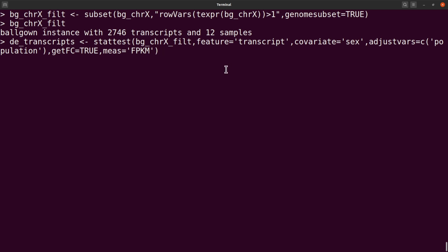Let's just check to make sure that everything is okay here. Okay, so I think we are good to go. Yeah, so let's run this command.